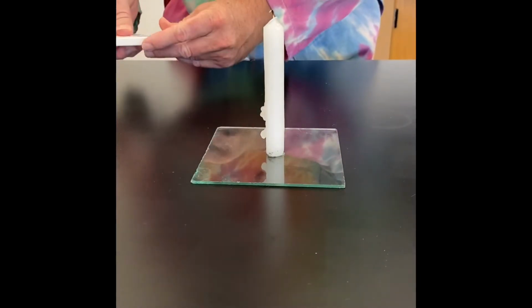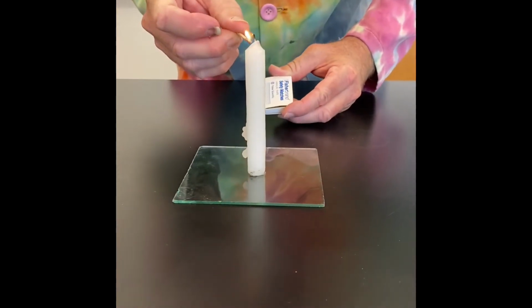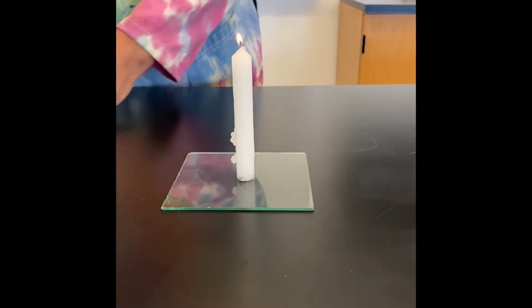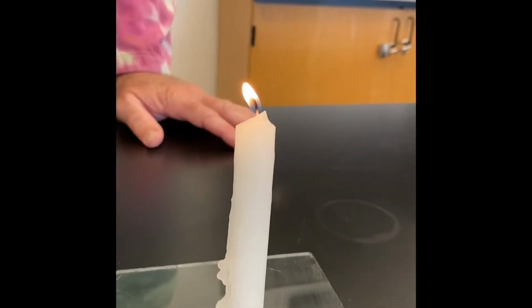Now I'll take a second match and I'm going to light the candle. And we're going to watch it burn for a few minutes here. And you want to describe the way the candle is burning.